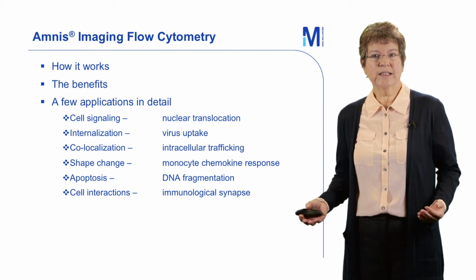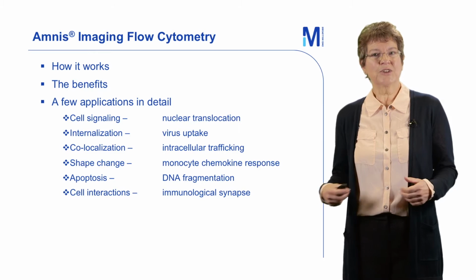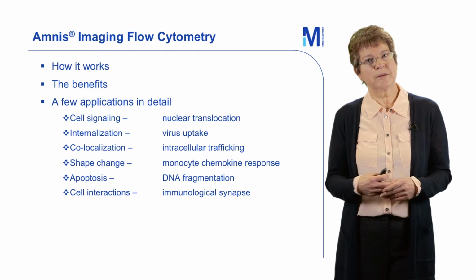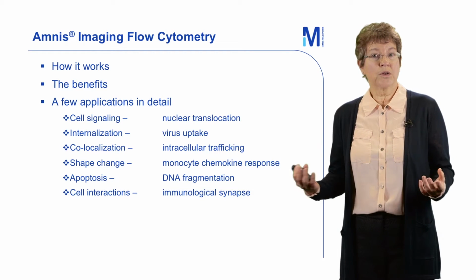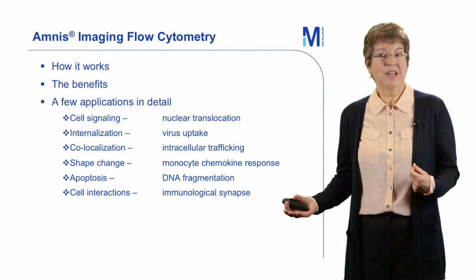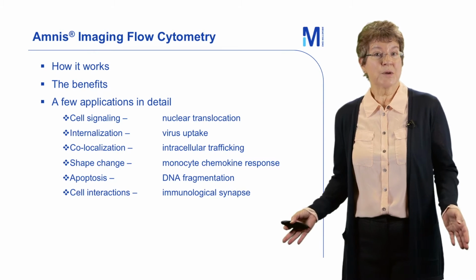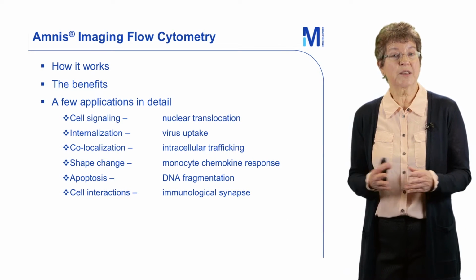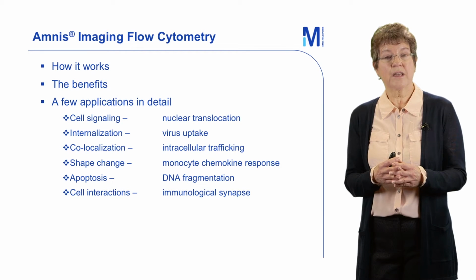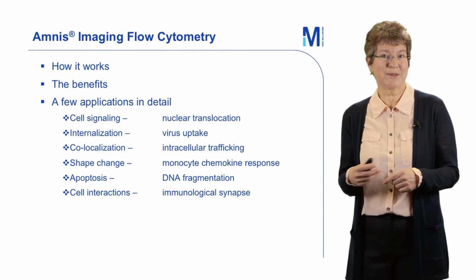I'll talk about cell signaling, nuclear translocation, internalization, looking at a model of virus uptake, colocalization, looking at intracellular trafficking, shape change, a monocyte chemokine response, apoptosis, looking at DNA fragmentation as compared with a couple of other methods, and cell interactions, finally looking at immunological synapses.